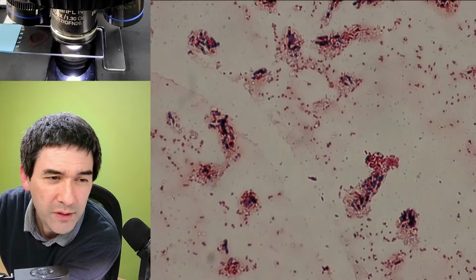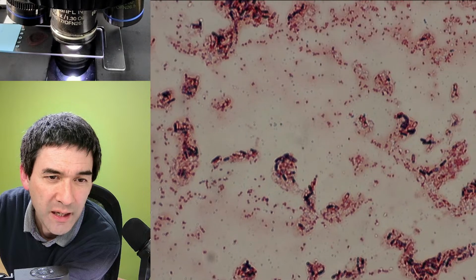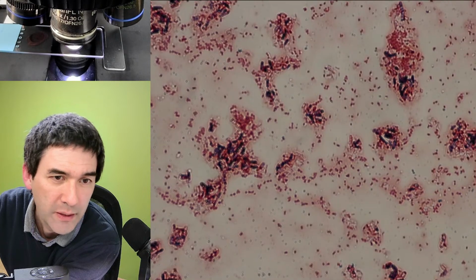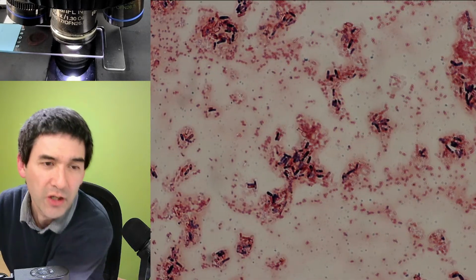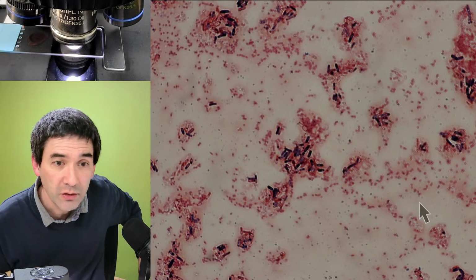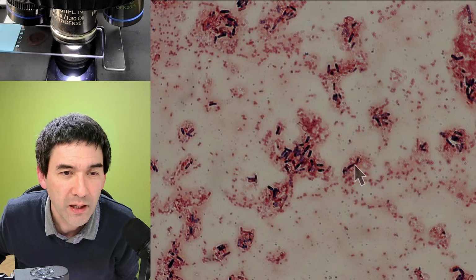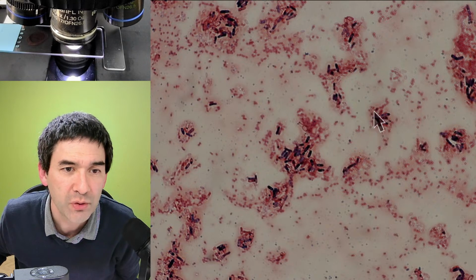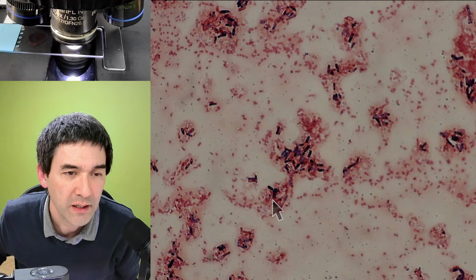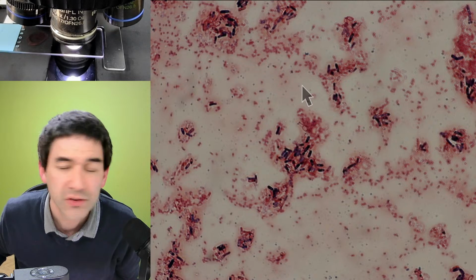Number one, and let's have a look. I wonder if you are able to see much better now that indeed we don't have a pure culture here. You see there are a whole bunch of tiny bacteria here, and some of them in between are staining much darker. They also have a different shape. So these are the gram positive ones, and here on the outside, those tiny ones are gram negative.